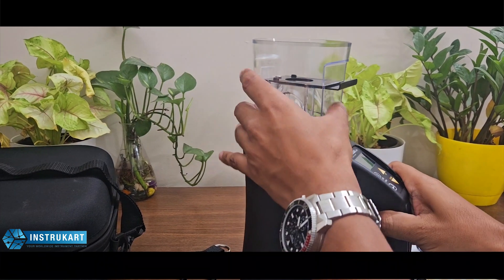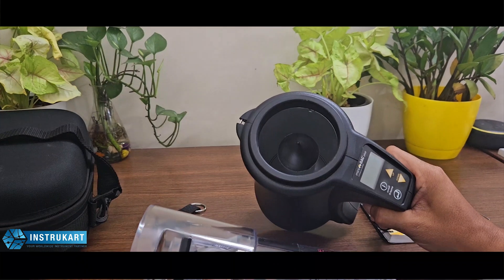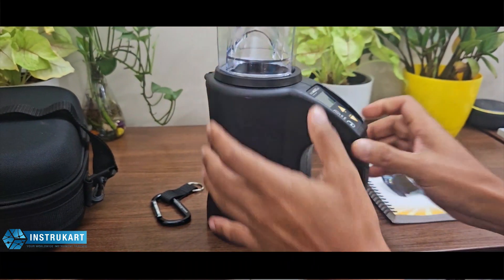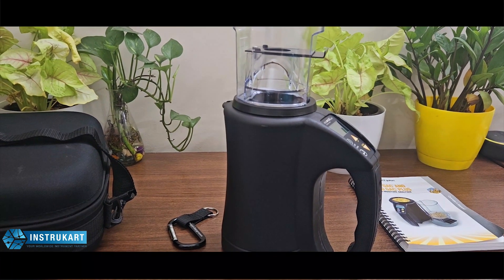This moisture meter has a weighing scale integrated along with the sensor, so that we can get the actual moisture based on the weight of that particular product.